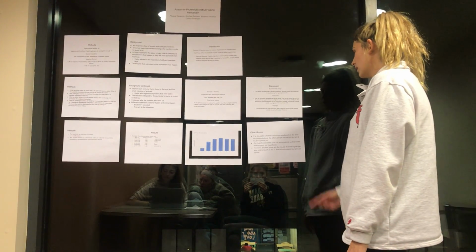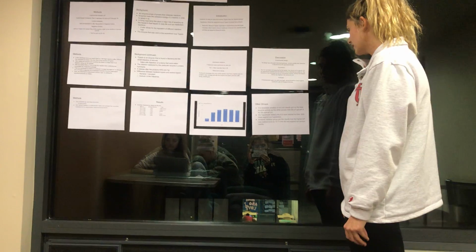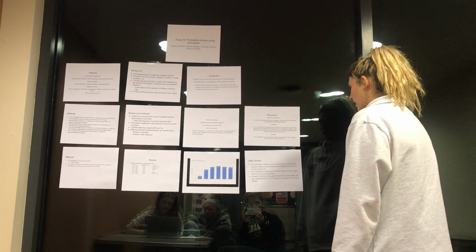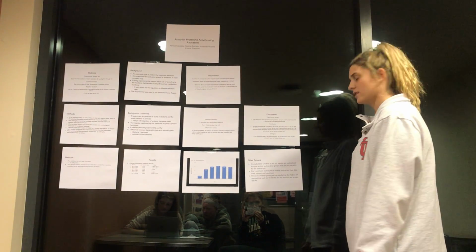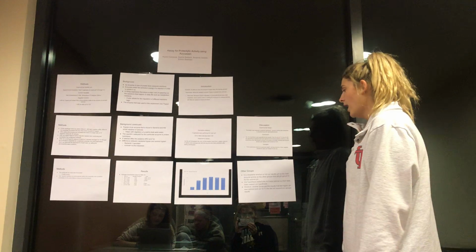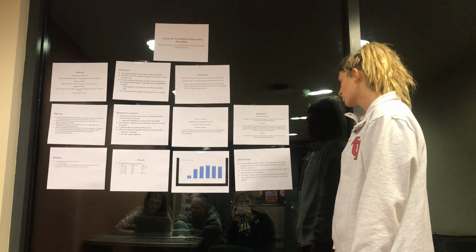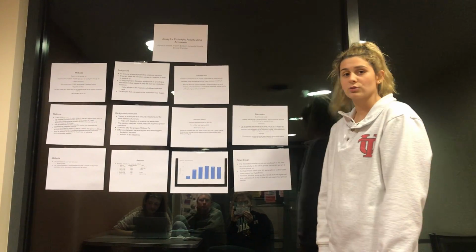Other groups: it is debatable whether or not our results got us the best enzyme activity, as the other groups that tested pH got pH 9 for the optimum, and our hypothesis stated pHs 8 to 9 were optimal, so their data does support our hypothesis. However, another group got the results that a higher pH was optimal, such as 10 to 11, and this did not support our group's results.